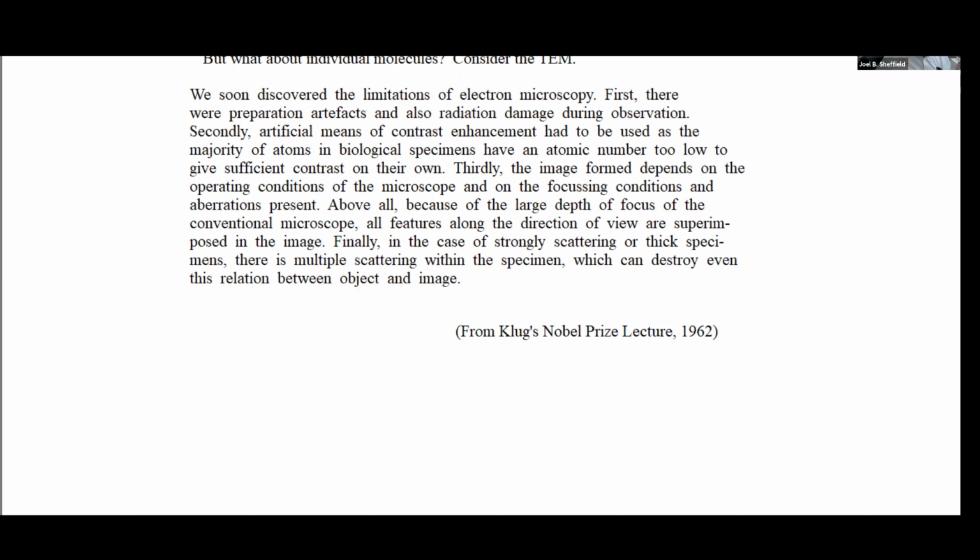When they started thinking about the transmission microscope, it was clear from almost the very beginning of its development that if you used the electron microscope under what was then considered standard conditions to visualize something, your tissues basically disappeared at the moment the beam hit them. They broke down, they were heated up, they were destroyed pretty much by themselves, okay?